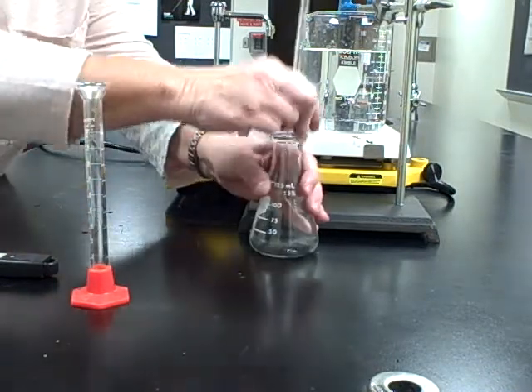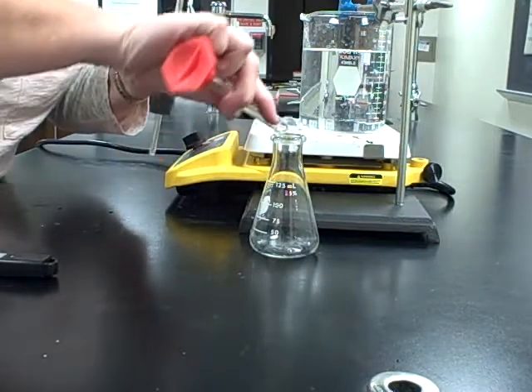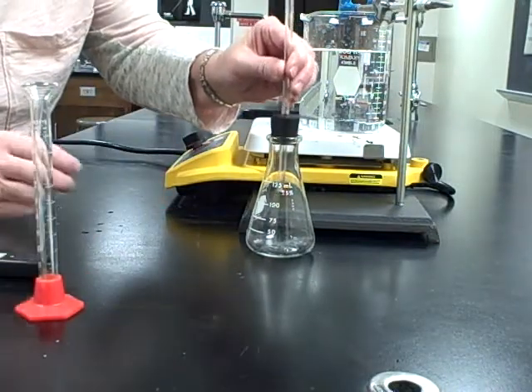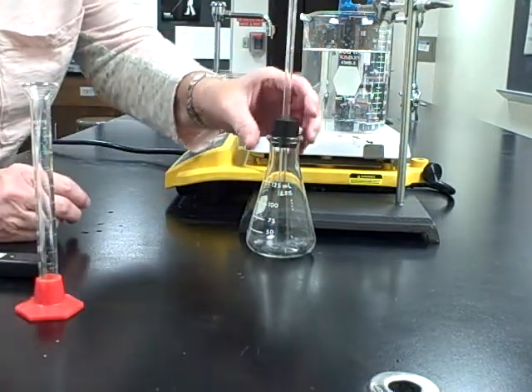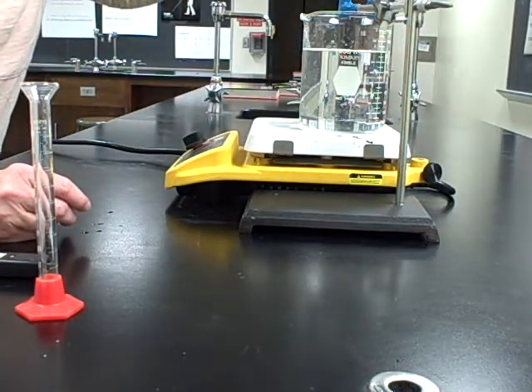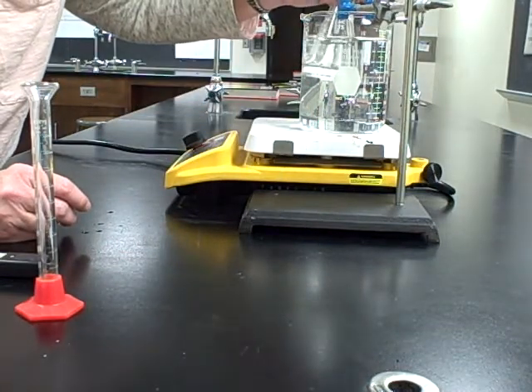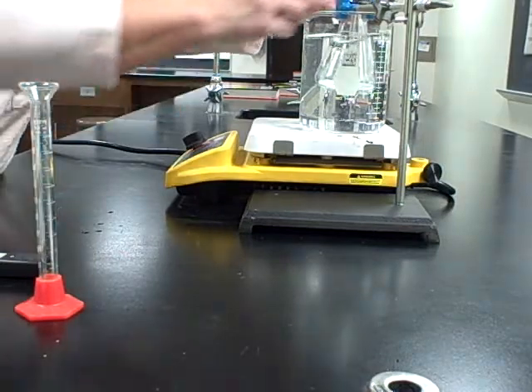Once I've put my volatile liquid in here, recap this right away in case any of it starts changing to a gas. Then step five says clamp the flask to a ring stand.